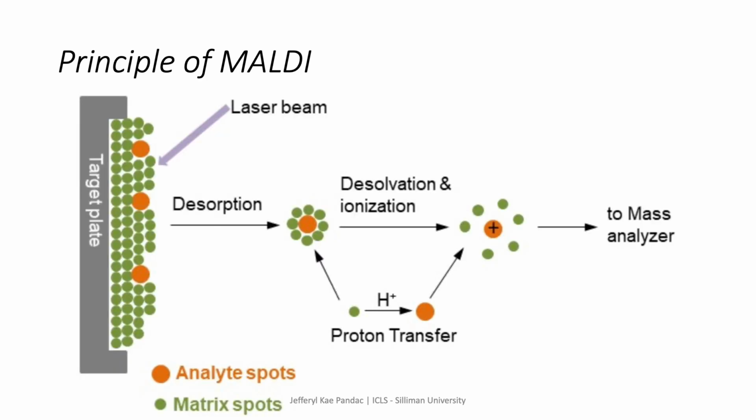For the principle of MALDI, the analyte is embedded in a very large excess of a matrix compound that is deposited on a solid surface called the target, that is usually made of a conducting metal and having spots for several different samples to be applied. After a very brief laser pulse, the irradiated spot is rapidly heated and becomes vibrationally excited. The matrix molecules, energetically ablated from the surface of the sample, absorb the laser energy and carry the analyte molecules into the gas phase as well.